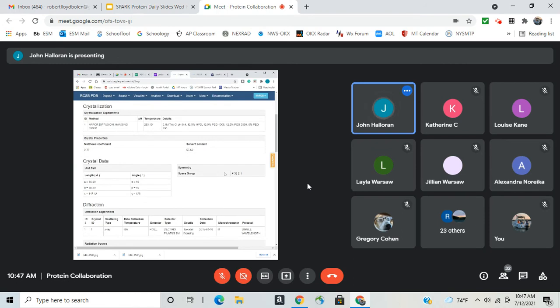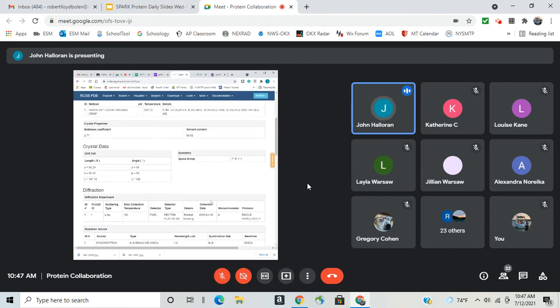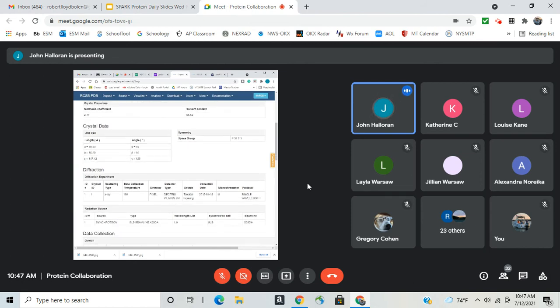And sometimes, and we don't always know why, the same protein, depending on the conditions you crystallize it, can form a different space group. That's actually one of the things that happened with one of our TRMDs. Everyone was getting it in one type of space group, and for some still undiscovered reason, ours was forming a different space group. Probably because the conditions we used were slightly different, or the protein was a little bigger, who knows. But that actually led to us being able to get some different information for the protein.